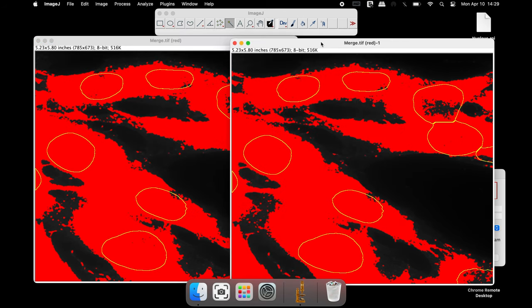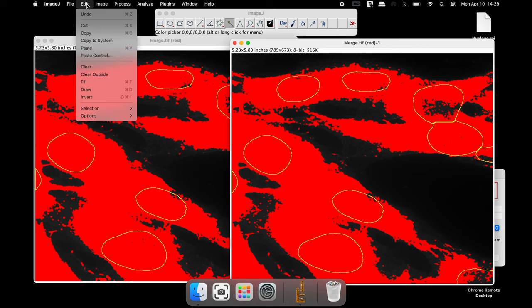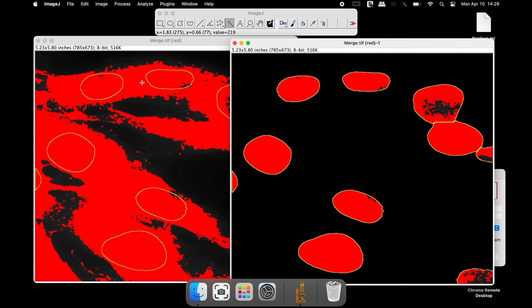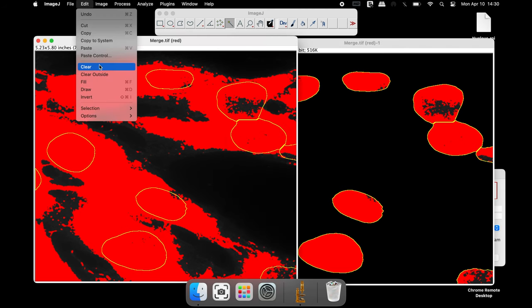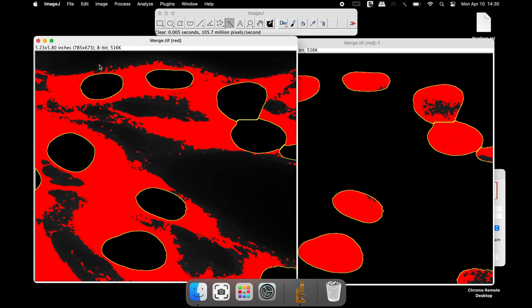To measure the red fluorescence intensity in the nuclei, first select the image and click on Edit and Clear Outside. For the cytoplasmic red fluorescence intensity analysis, first click on Edit and click Clear.